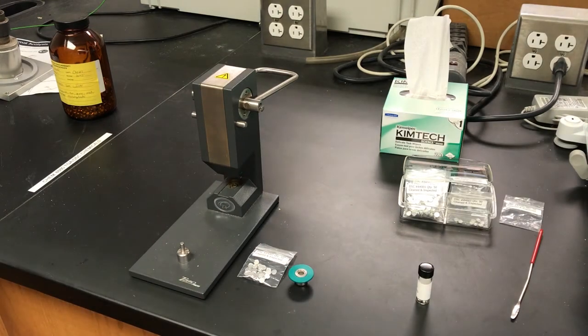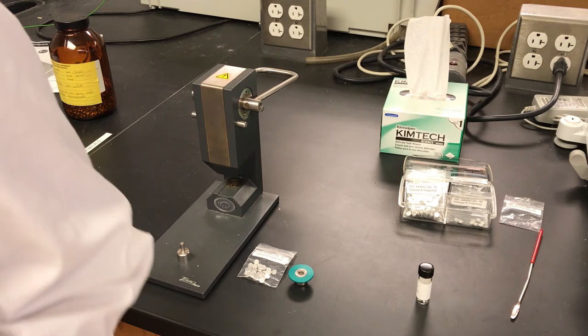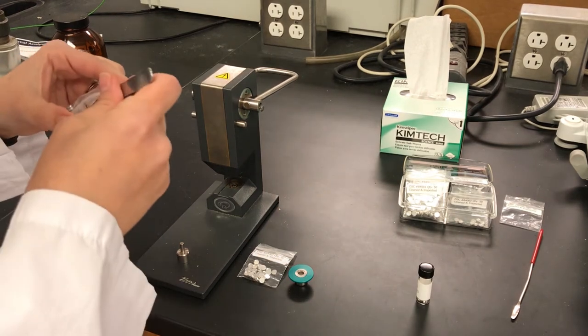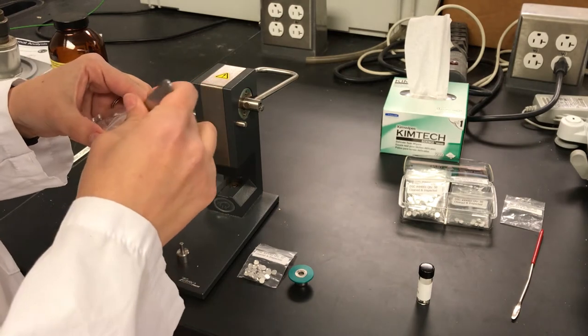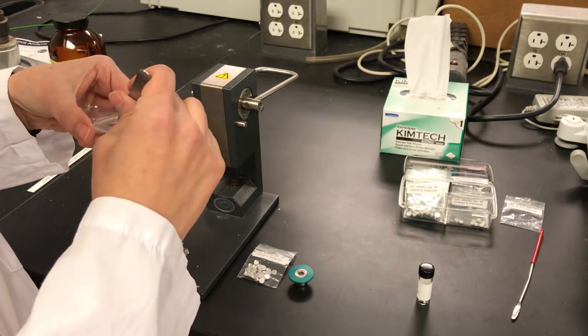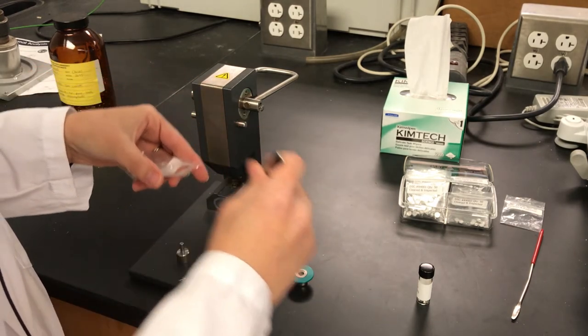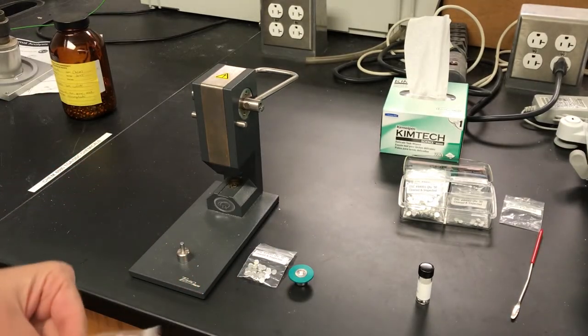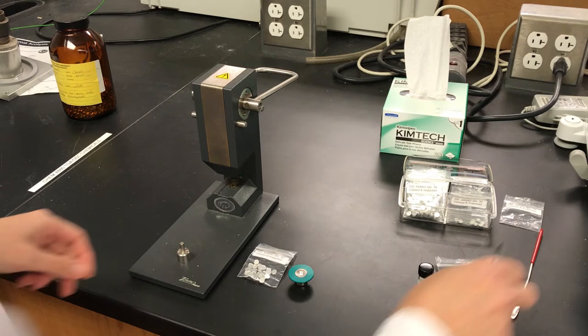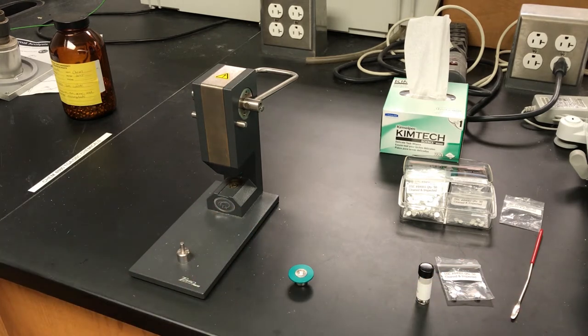So we need to use our pans and our lids. So I'll show you how to put together a sample pan. It's a good idea to use some forceps when you're handling these pans so you don't get your oils from your fingers on the pans themselves. And these are aluminum pans. They can be heated up to 600 degrees Celsius, but no higher than that as they'll melt and cause a large problem in the instrument.